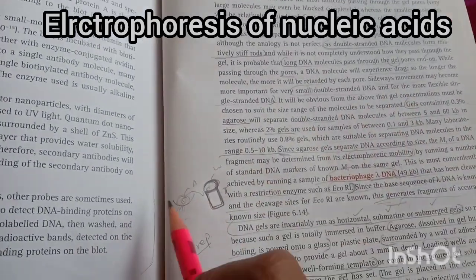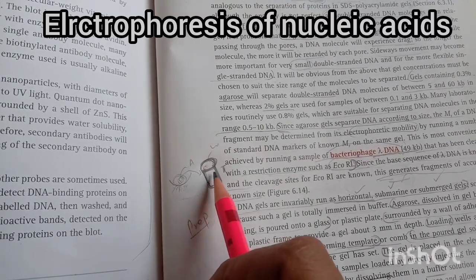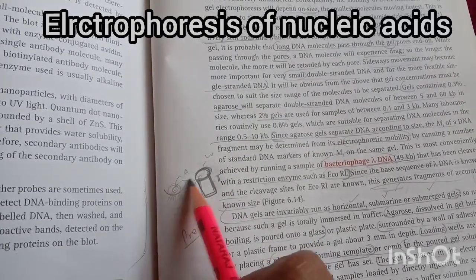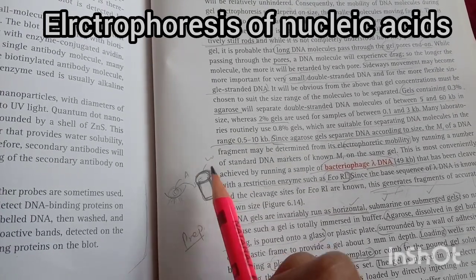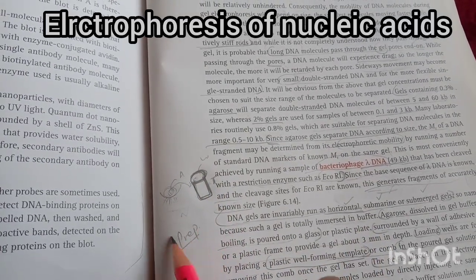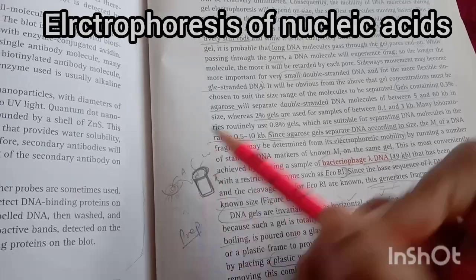I repeat, firstly the agarose gel is dissolved in gel buffer by boiling, okay? It is poured onto the glass, surrounded by a wall of adhesive tape. After that, the plastic well-forming template is loaded, okay? So in the poured solution the gel is placed, and this gel is placed in the electrophoresis tank and covered with the buffer. This is open, and this is covered by the buffer.